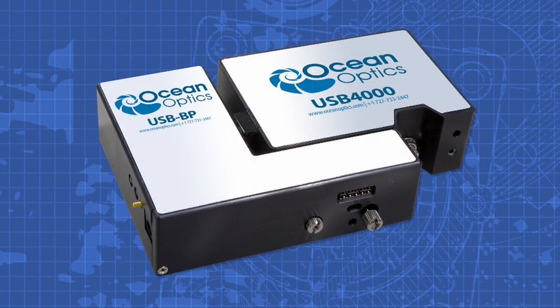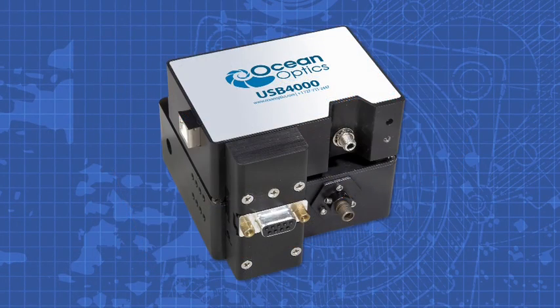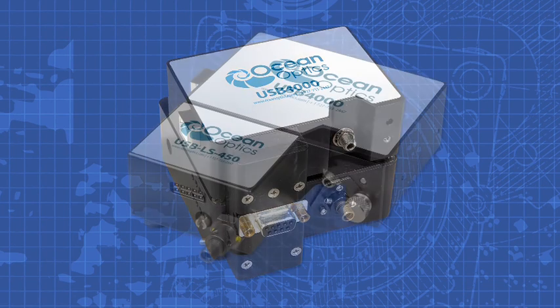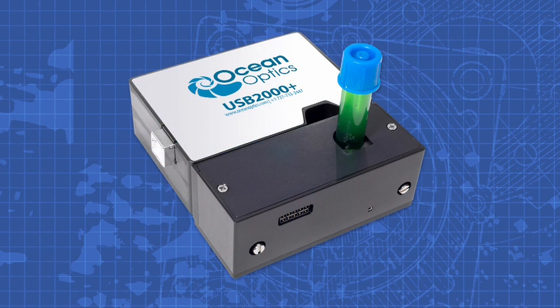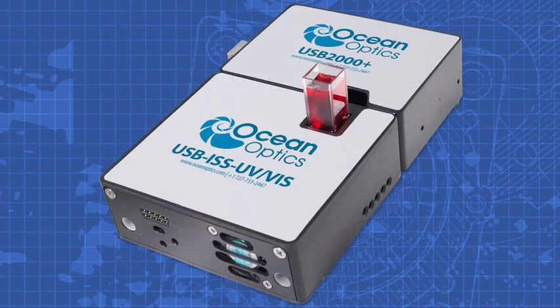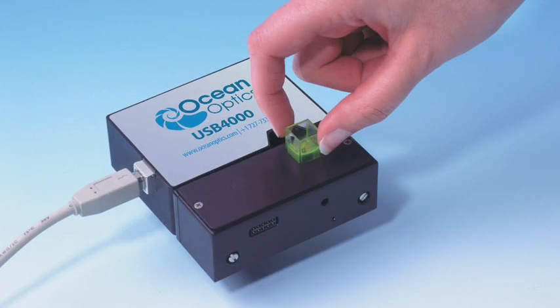The USB 4000 is the ideal foundation to create application-specific systems for thousands of absorbance, reflection, and emission applications. The USB series can be combined with many different light sources and sampling accessories to create your ideal system.